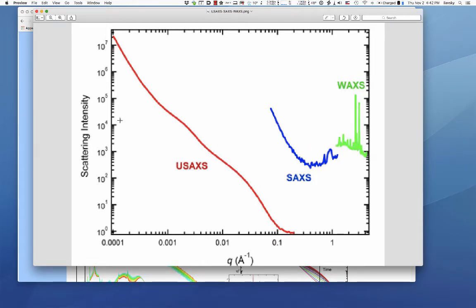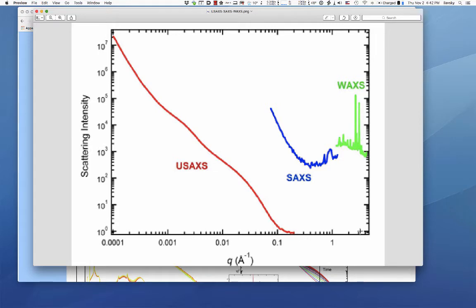If you combine segments one, two, and three you get data over about four and a half decades in size — from basically microns down to an angstrom or so.